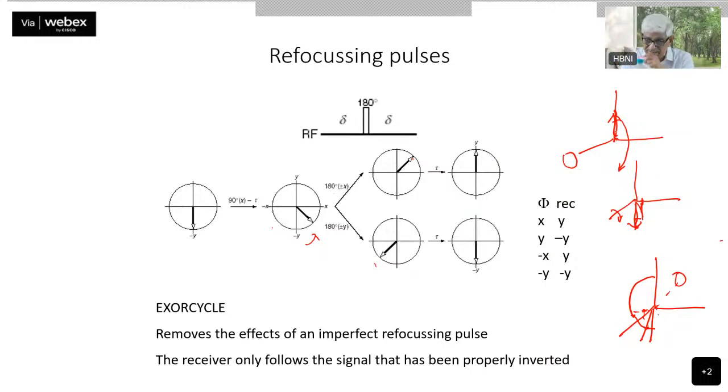These are shown with the Z magnetization. The same thing applies here as well, to the transverse plane also the same thing applies. If the 180 pulse is not proper, there will be certain component remaining along the Z axis, and that Z axis component you cancel out by cycling the phase through as y, minus y and x, minus x in that manner. Okay, so this is for the refocusing pulses or the inversion pulses. This is also an inversion pulse. In the transverse plane, when you're talking about it, it is a refocusing pulse. If it is for the Z axis, that is an inversion pulse.